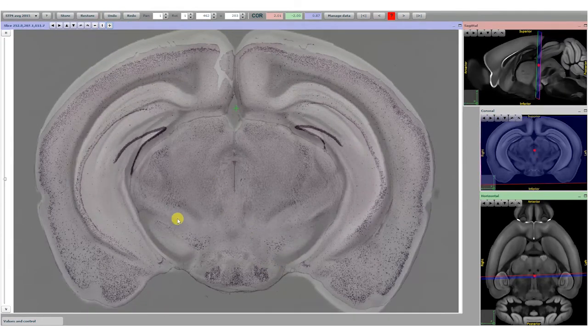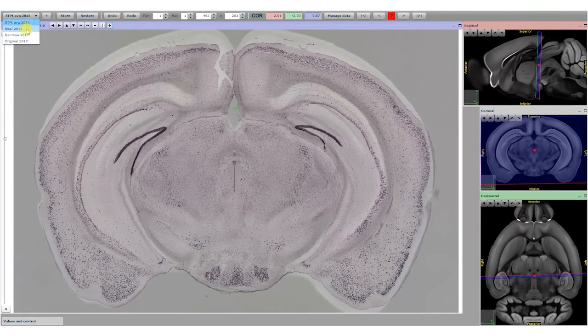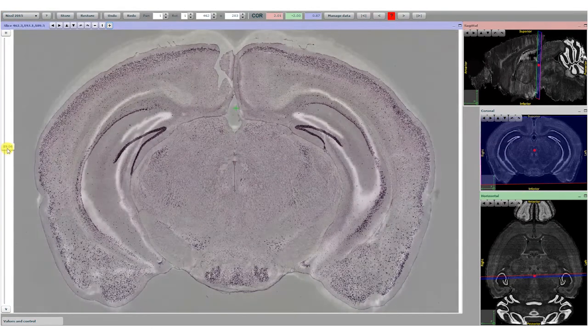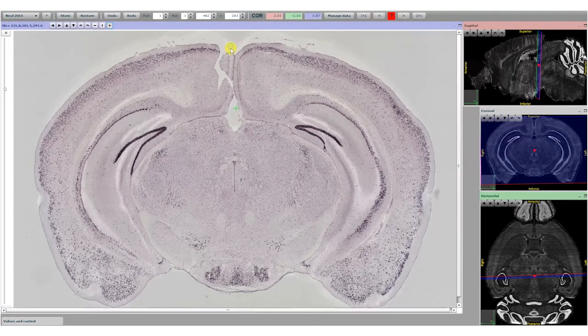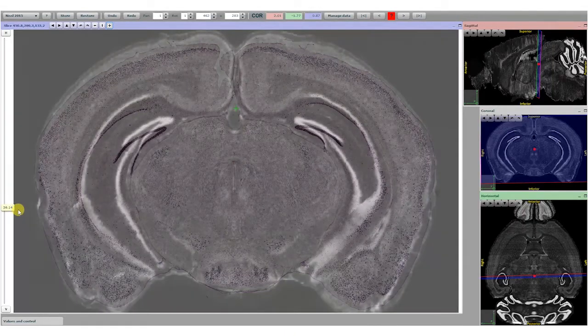This is because I have a small tilt that I can correct here. So here, 2 degrees tilt. And then the same thing here. I can adjust the tilt so it matches exactly my experimental image, and then store.